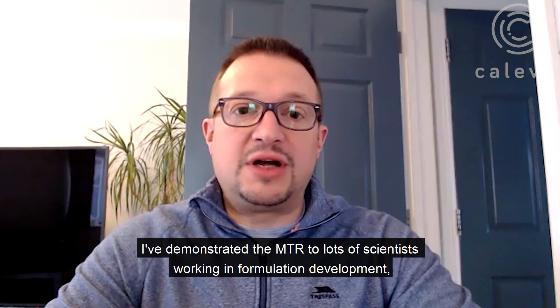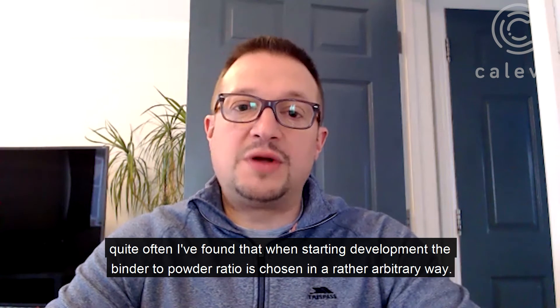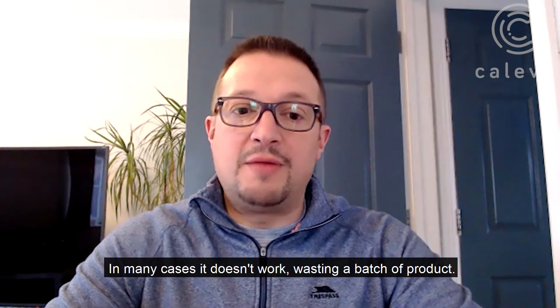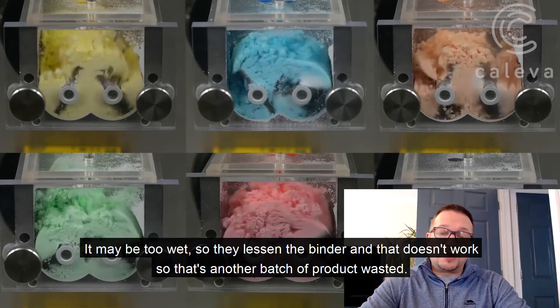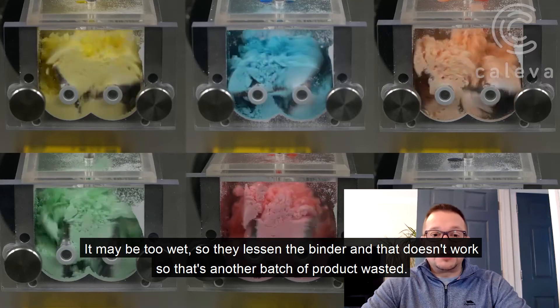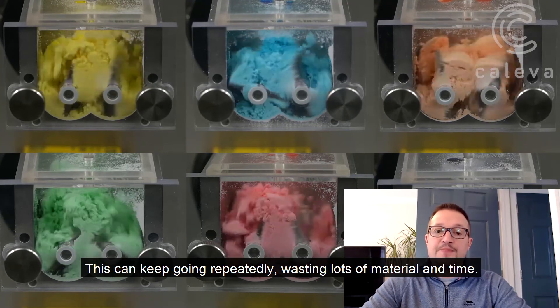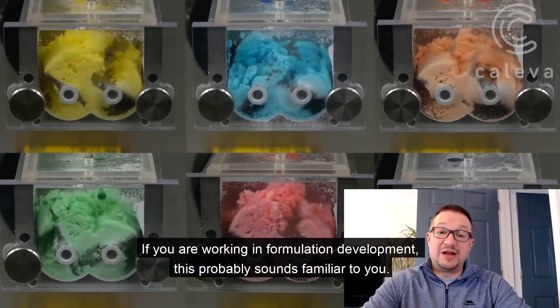I've demonstrated the MTR to lots of scientists working in formulation development. Quite often I've found that when starting development, the binder to powder ratio is chosen in a rather arbitrary way. In many cases it doesn't work, wasting the batch of product. It may be too wet so they lessen the binder, and that doesn't work so that's another batch of product wasted. Now it's too dry and another batch wasted. This can keep going repeatedly, wasting lots of material and time. If you're working in formulation development, this probably sounds familiar to you.